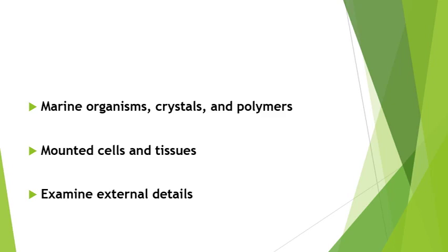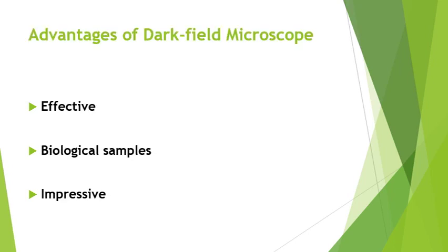It is also very helpful to examine external detail of various microorganisms. So dark field microscopy is very effective for observing different types of biological samples.